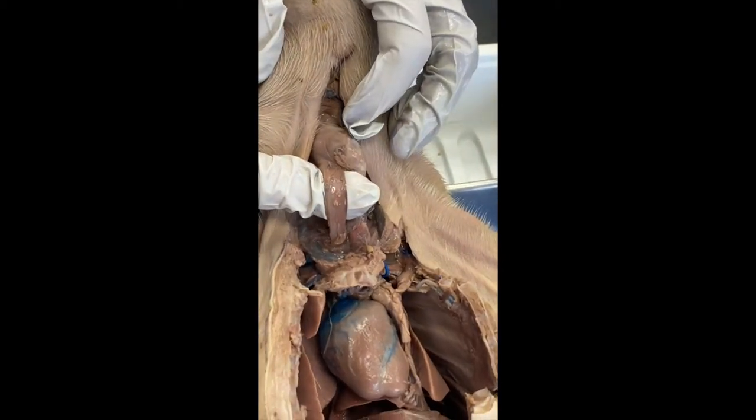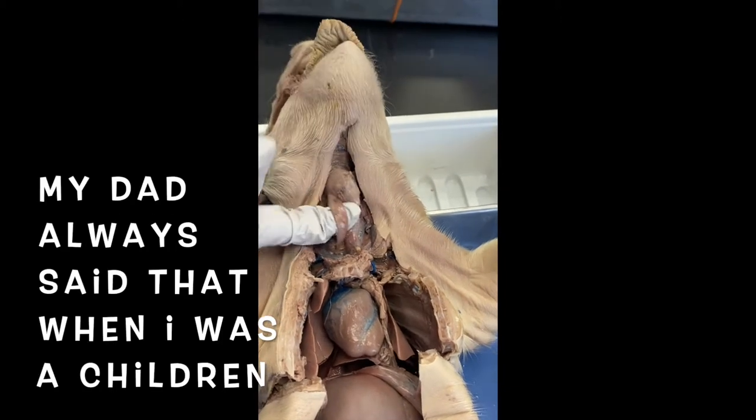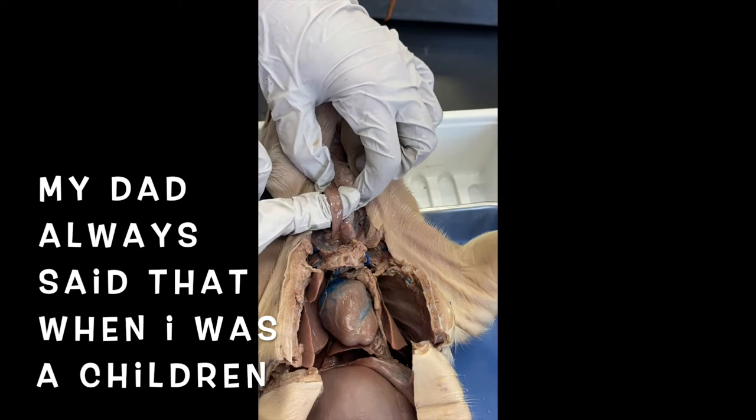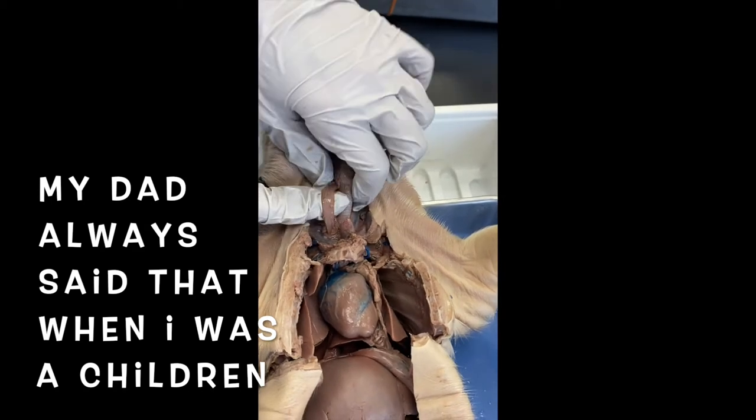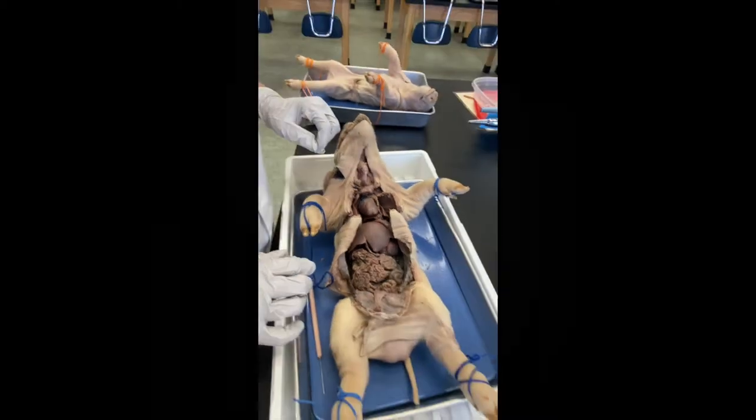There's the tube. Is that what they mean by it went down the wrong pipe? You hope you don't get food in your lungs and the epiglottis works. Okay. Yes. All right. Sorry, I just thought of that just now. Excellent. I'm trying not to talk too much. Okay.